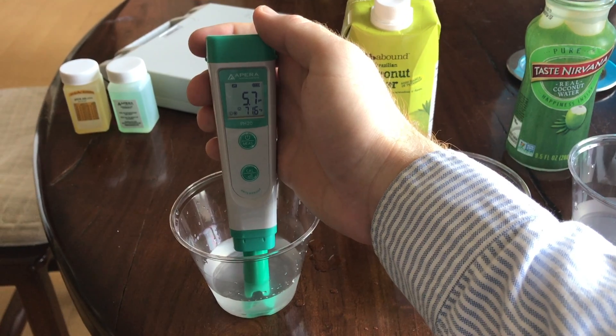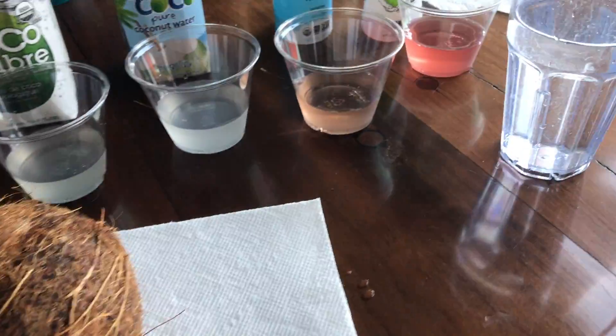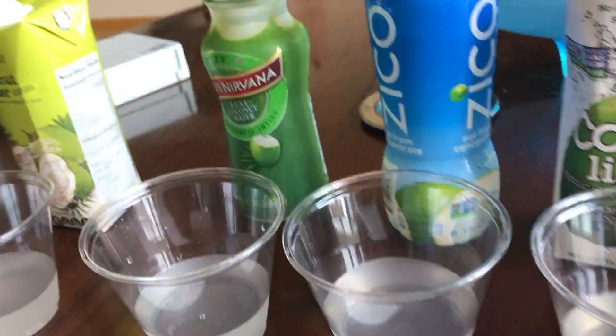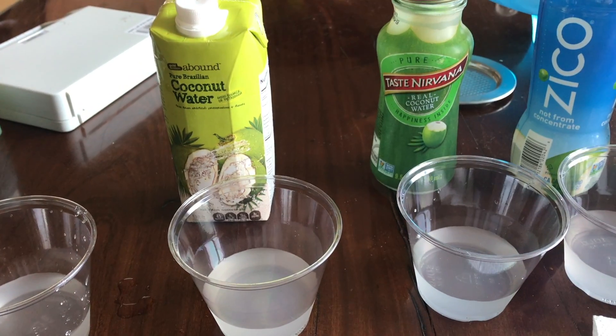I'm guessing the pH of real coconut water to be around 5.8. 5.7 — I was pretty close. Now I'm just going to recalibrate this electronic meter and move on to the next one. So 5.7 is the pH to match.